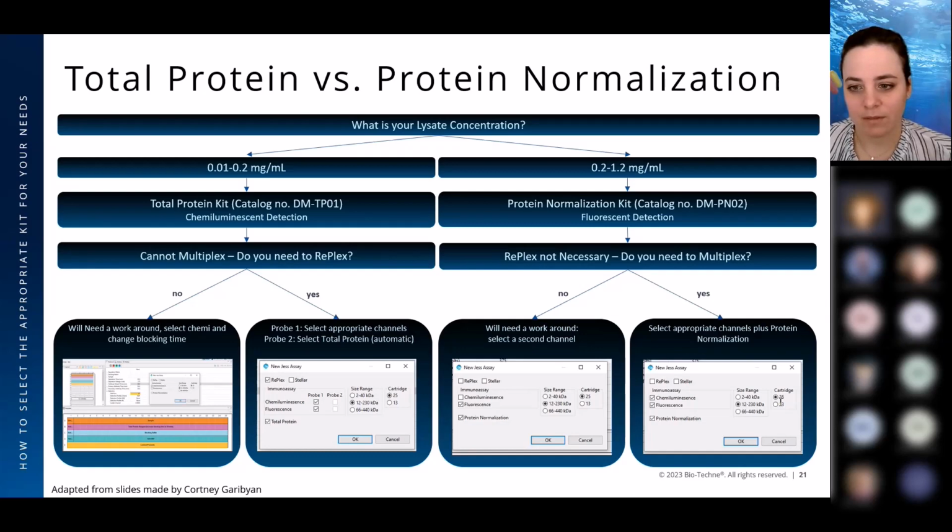I've actually put some precautions on the protein normalization reagents. It's been a while since I've done it, but I think both are kept in the freezer and then you take it out at the last minute and then you mix it together. Not sure if the reconstitution is at room temperature. It was even in one of your training quizzes to keep it at room temperature, and it's in the pamphlets too. And that's why it was a little bit confusing.